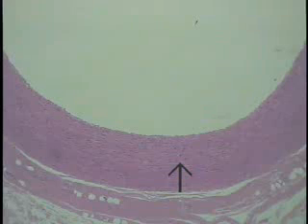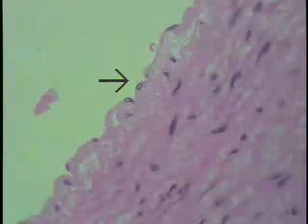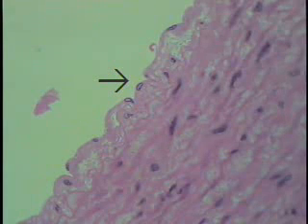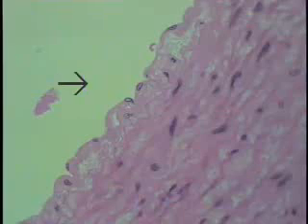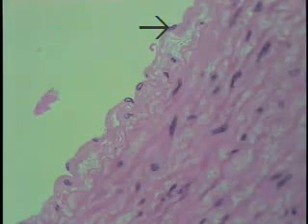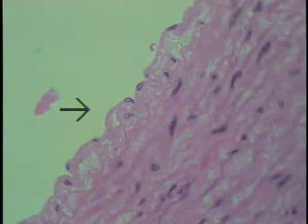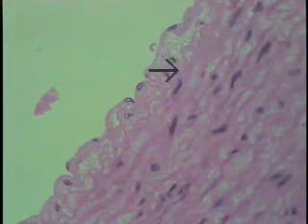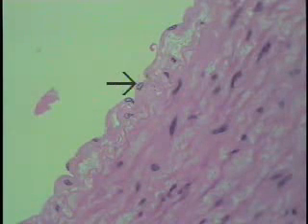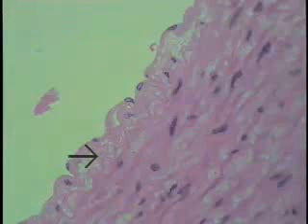Now let's proceed and examine this vessel wall at a higher magnification so the details can be studied. This is an example of the aorta as seen at increased magnification. The lumen, of course, is shown here, and the pointer indicates the endothelium and nuclei of endothelial cells lining the luminal surface. The endothelium, together with this underlying connective tissue up to about this elastic membrane as shown at the tip of the pointer, constitutes the tunica intima, corresponding, as we mentioned before, to the endocardium of the heart.